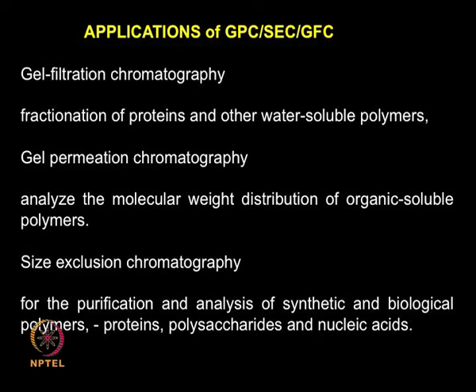So you see, I can use it for fractionating protein and other water soluble polymers. I can use it for analyzing the molecular weight of synthetic polymers. I can use it for purification of synthetic and biological polymers, protein, polysaccharides.